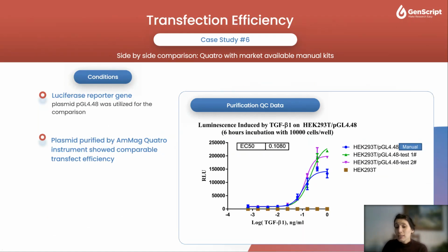This is one of the last case studies I have to show. What we did here is take one of our services plasmids, which was prepared using a manual kit.